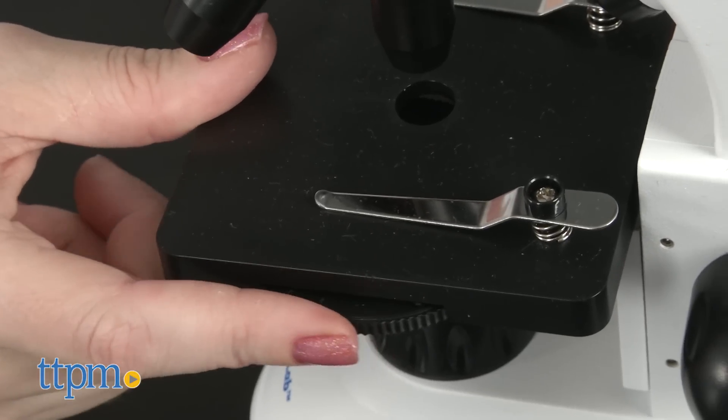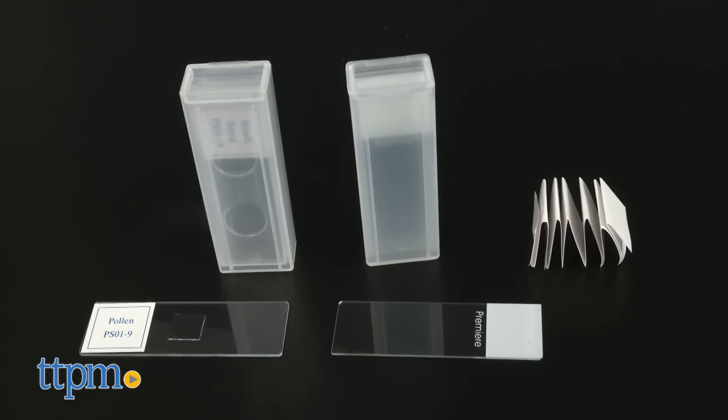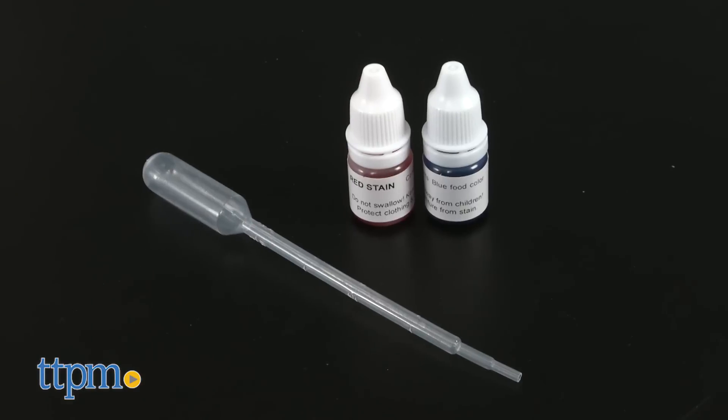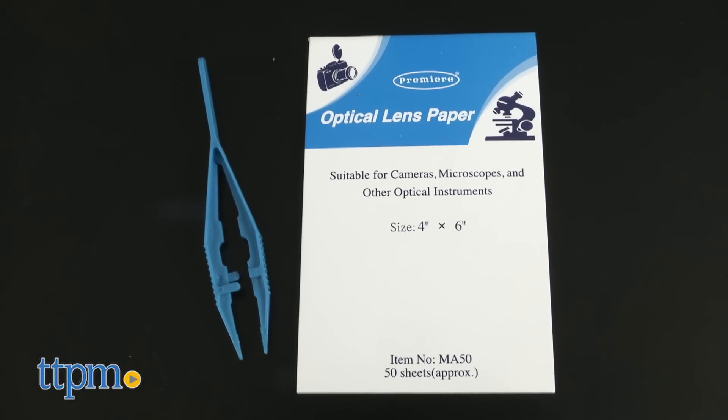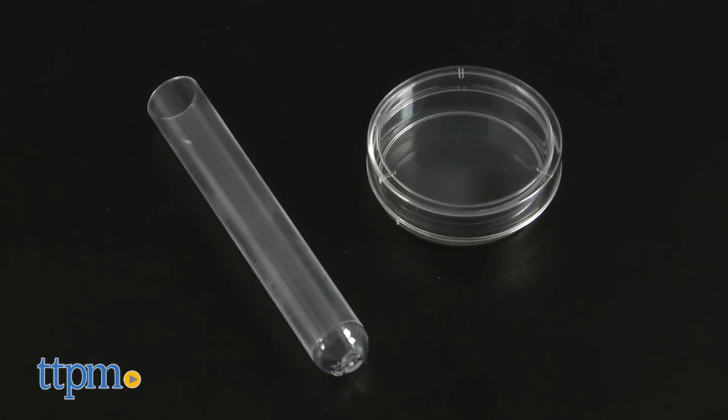Plus, you get more than 50 accessories to jumpstart your scientific research including slides and labels, a dropper, two bottles of non-toxic stain, forceps, lens paper, a test tube, and a petri dish.